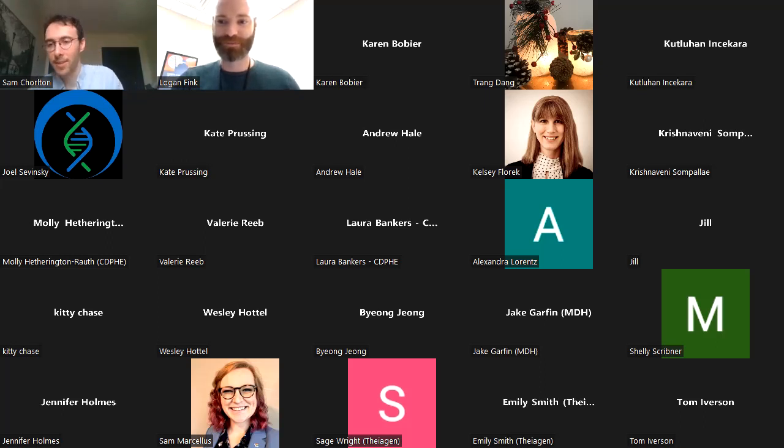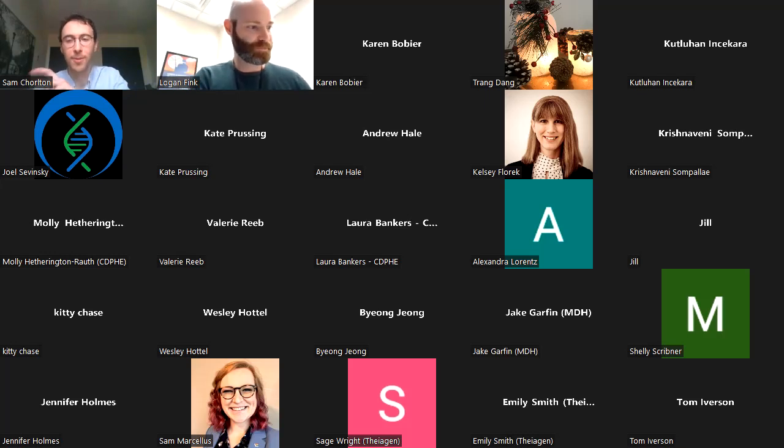I should say that currently it's tailored for long reads. However, Minimap2 can easily handle short reads as well, as I'm sure you're aware. We haven't compared it against any of the other tools because none that we saw out there did both long reads and short reads effectively with high sensitivity and specificity. Credit to Heng Li, the tool is fantastic for sensitivity, specificity and speed. So this is really just a tuned approach to leverage Minimap2 to filter reads.